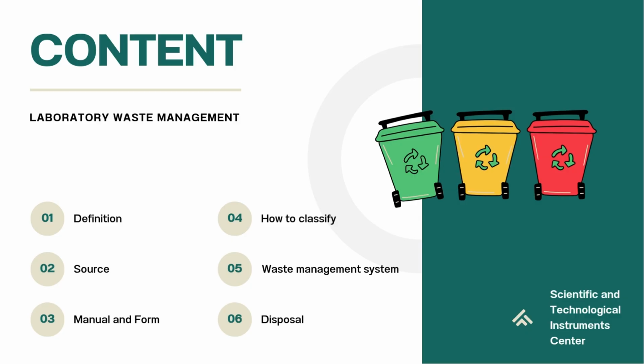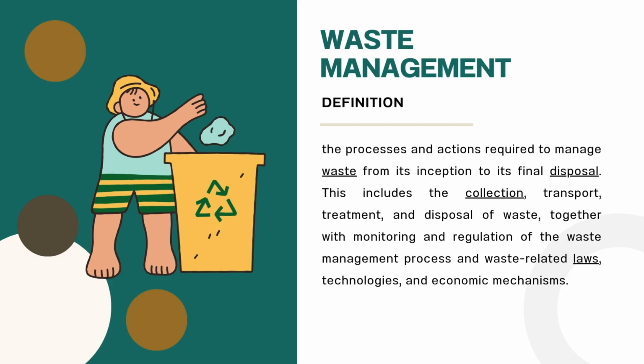We will start by understanding what waste and hazardous waste are. Then, we'll explore where waste in laboratories comes from and how we classify different types of waste. After that, we'll take a look at the waste management system, the required forms, and how waste is finally disposed of at MFU. By the end, you'll know exactly what to do when handling laboratory waste. Let's begin with the basics.